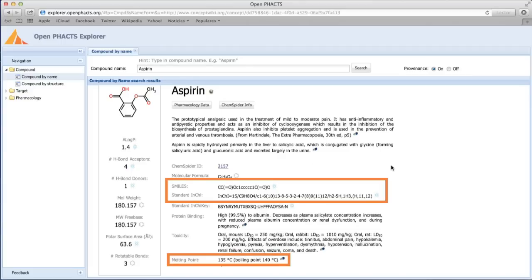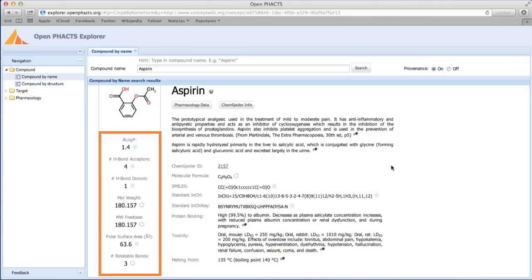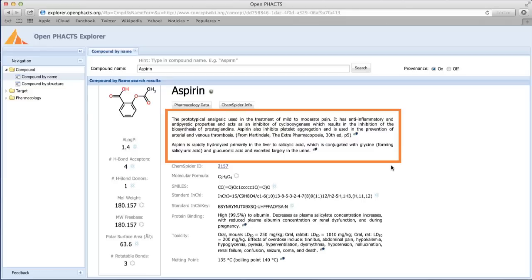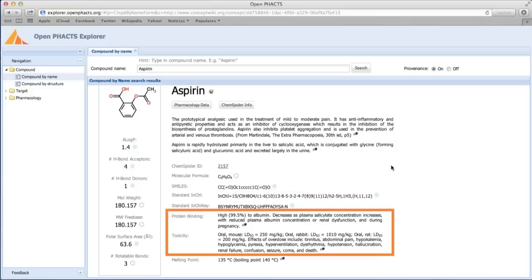Then we have calculated properties like AlogP, the number of H-bond donors and acceptors, PSA, etc. Then we have biological properties, a description of the drug, composition and metabolism, and finally protein binding and toxicity information.